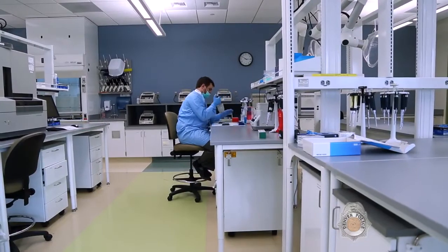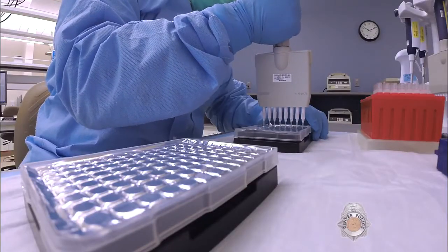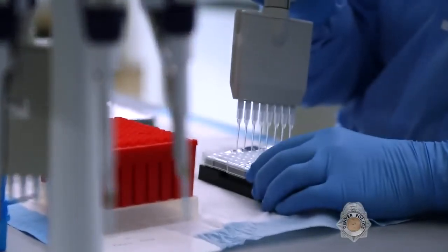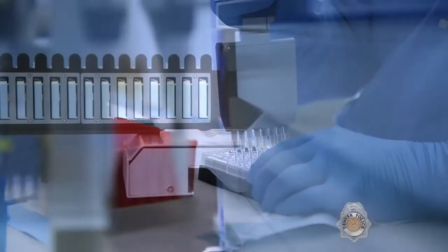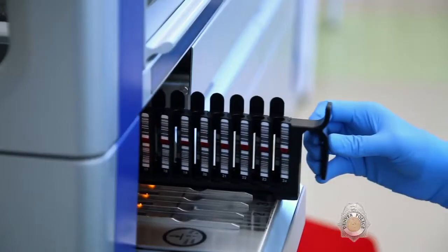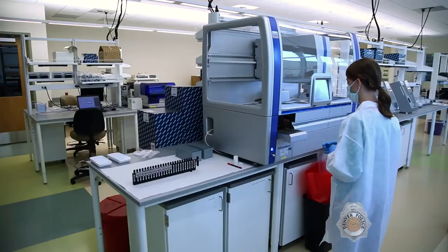The DNA analysis process uses a variety of manual and cutting-edge robotic methods to analyze samples and develop DNA profiles. Every DNA sample goes through a four-step process. The first is a DNA extraction, which is done to purify the DNA in a sample.